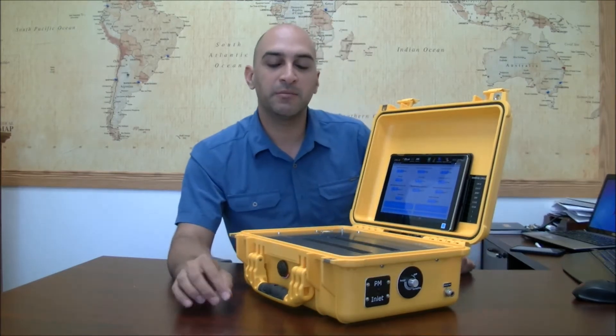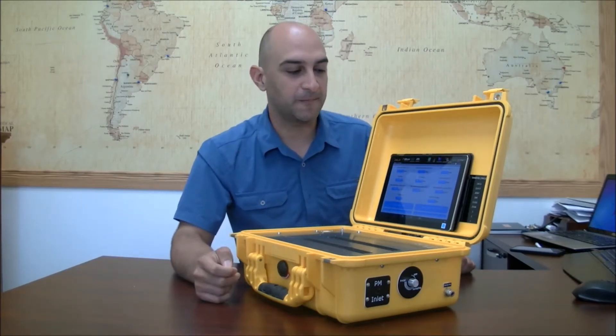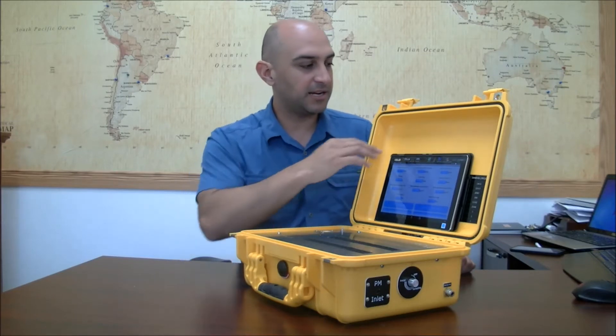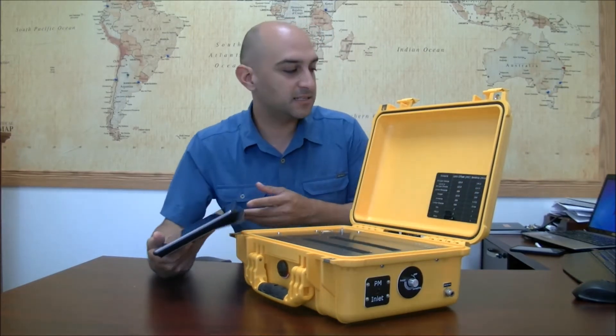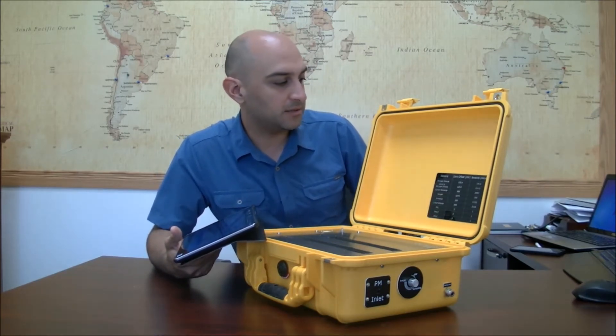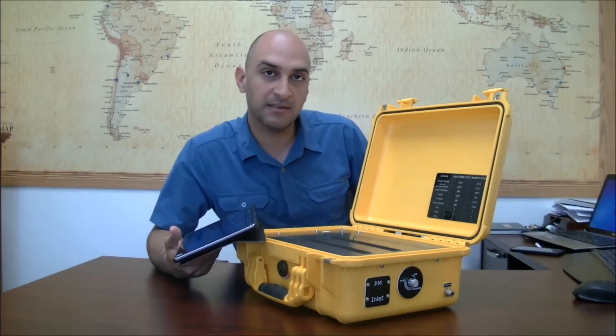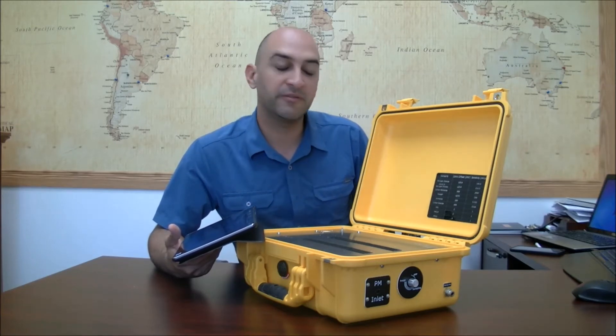Here we're going to measure PM1, 2.5, and 10 simultaneously using the PoloTracker. This particular PoloTracker has in it several sensors such as nitrogen dioxide, ozone, nitrogen oxide, carbon monoxide, oxygen, ammonia, and carbon dioxide — and simultaneously we'll measure PM1, 2.5, and 10.